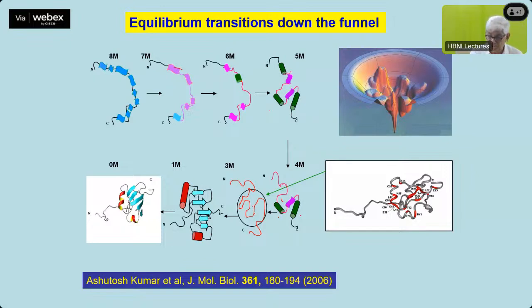You look at this structure, if I plot these changes that are happening in the R2 values by the color code of the individual amino acid residues, and mark these residues here in the red color. What this means is that the protein is actually going, folding and unfolding, folding and unfolding, the exchange contribution is happening. Okay, therefore R2s are increasing. And so when the fast motions slow down, the slow motions will increase. Okay, intermediate exchange, that is where the folding transitions will happen, meaning millisecond to microsecond time scale motions will be there. Nanosecond time scale motions will go down.